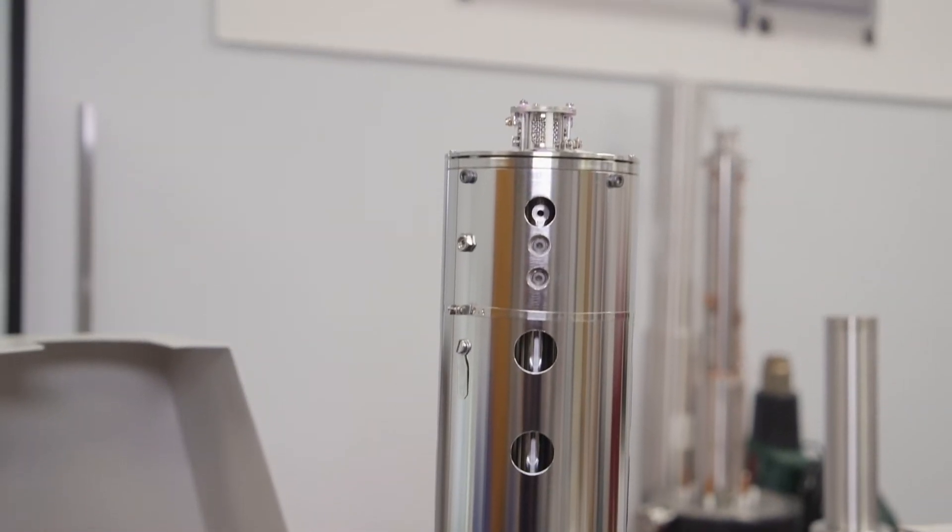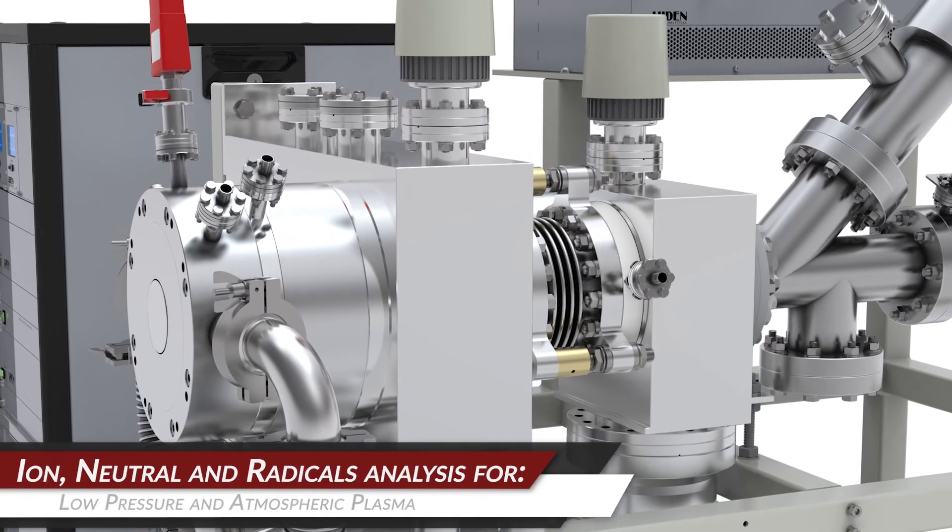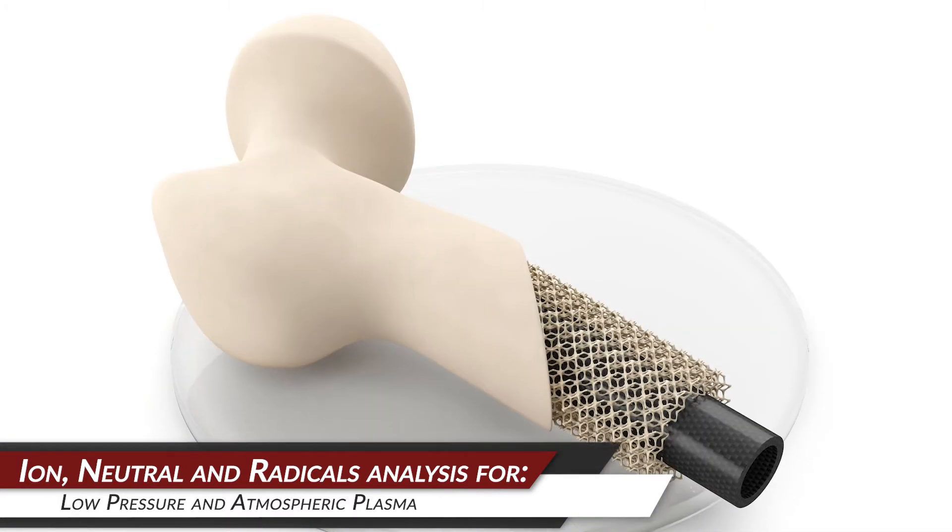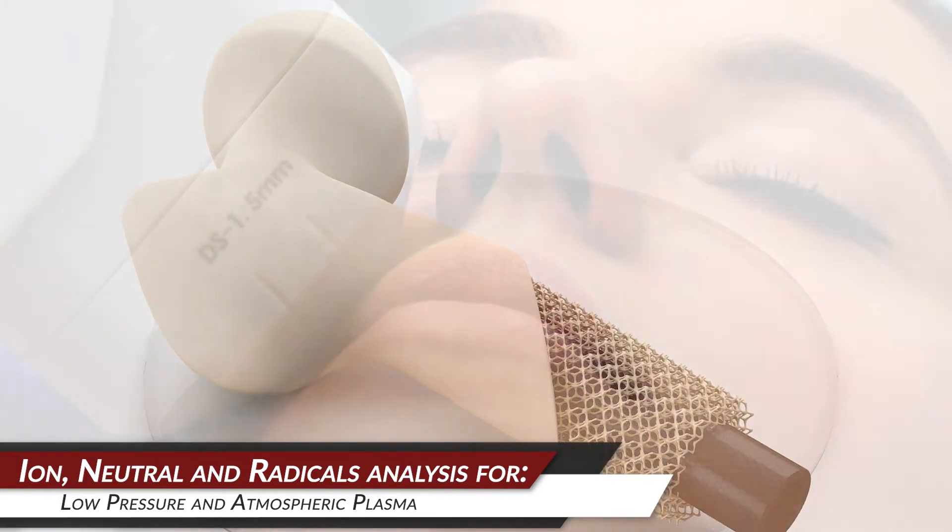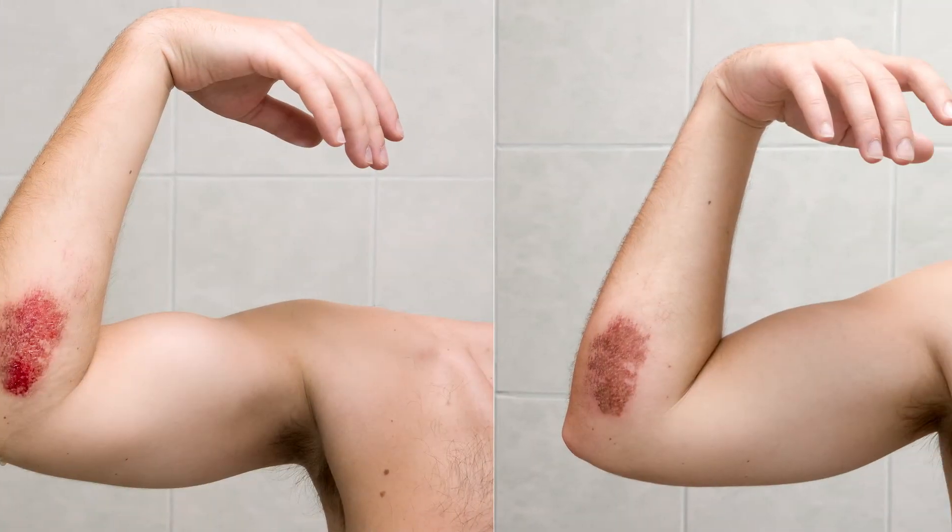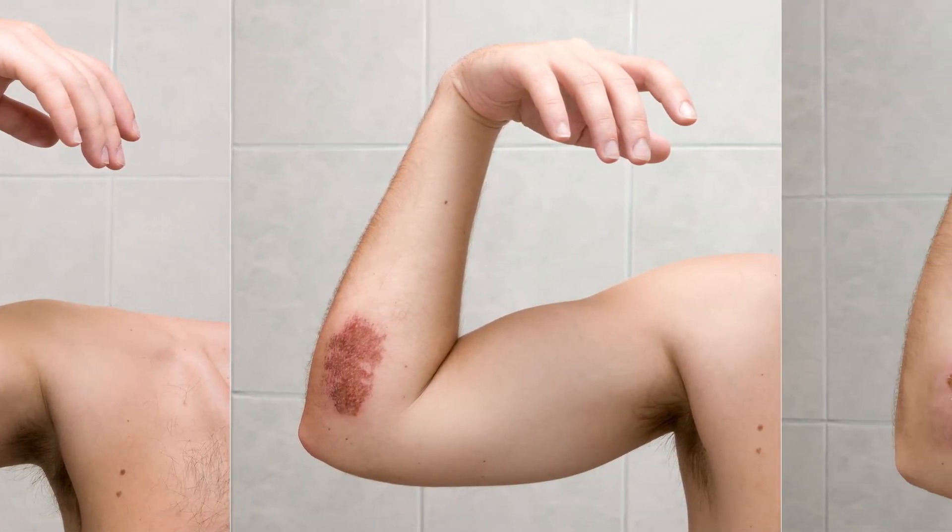In terms of plasma applications there's two broad areas that Haydn cover and that's low pressure plasmas and atmospheric plasmas for various types of research and applications. We have the Haydn HPR-60 system which can be used to characterize directly atmospheric plasmas which are generally used for medical treatment applications as well as surface treatment applications. These plasmas are highly ionized inert gas-based plasmas which are a combination of electrons, ions, neutrals and radicals as well as UV.